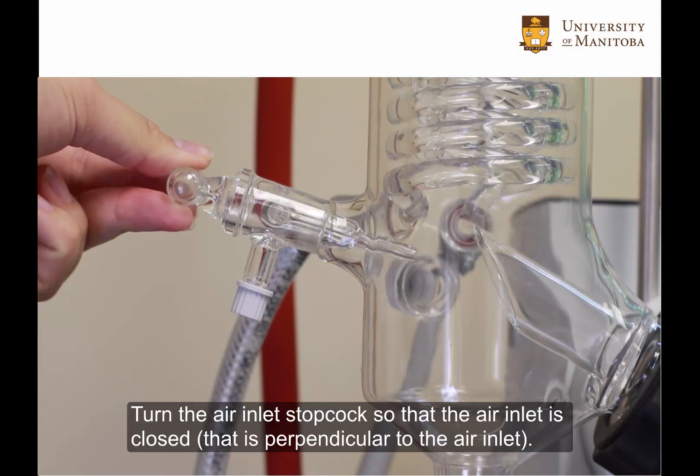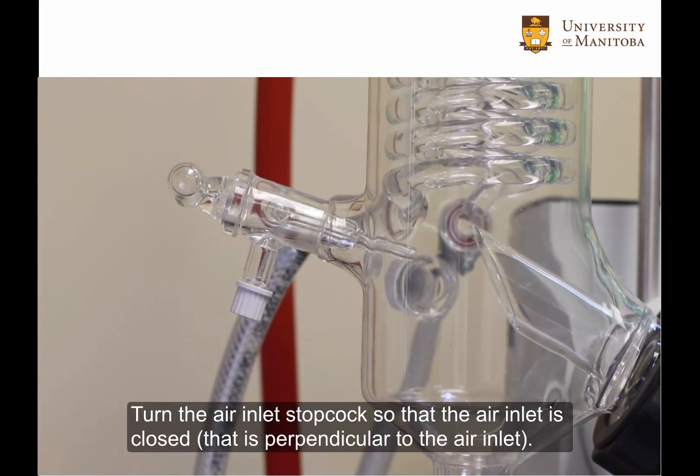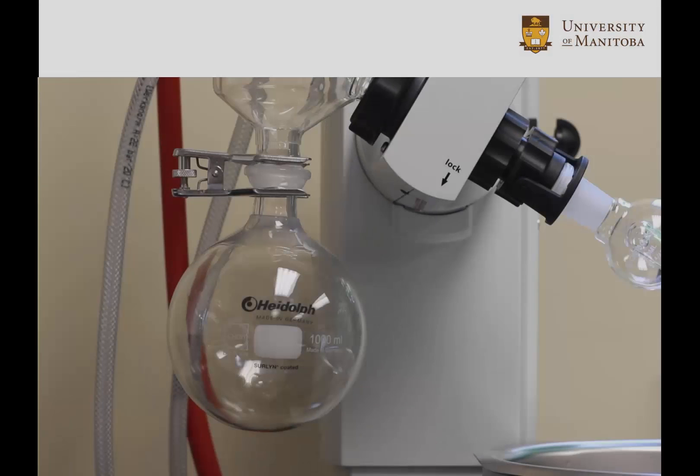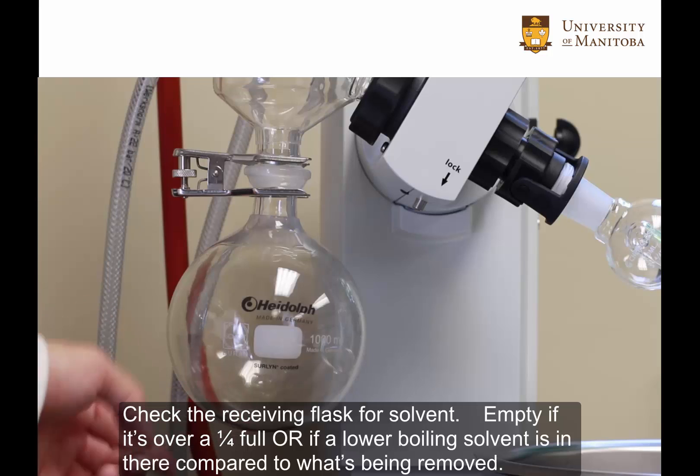Turn the air inlet stopcock so that the air inlet is closed — that is, perpendicular to the air inlet. Check the receiving flask for solvent, and empty it if it's over a quarter full or if a lower boiling solvent is in there compared to what's being removed.